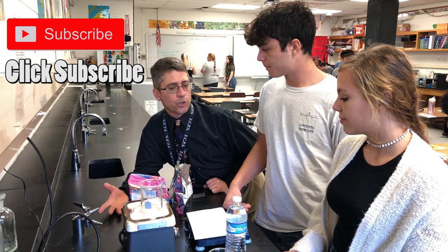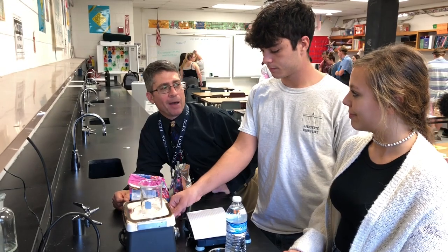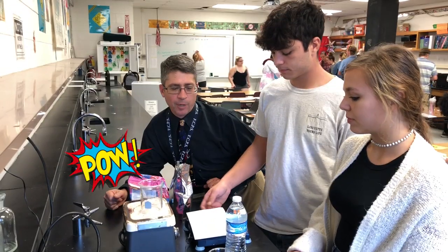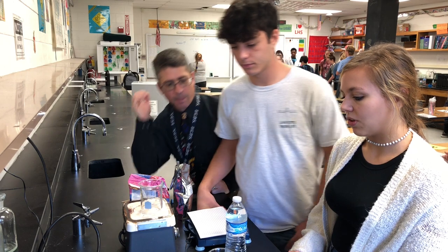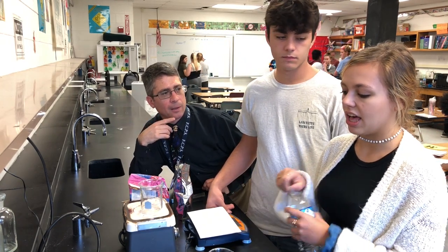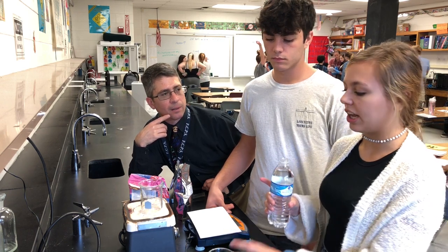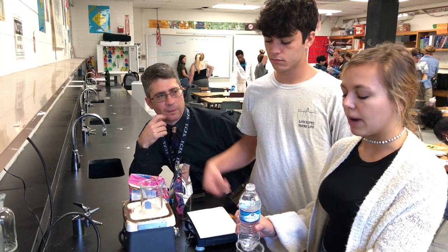So the CO2, what does that do for the root beer? It carbonates the root beer. Ah, so we're making a carbonated beverage. All right, well, let's get this lab going. Show us how it's done. Walk us through the process. The first thing we're going to do is measure 25 milliliters of spring water, and we're going to heat that on a heating plate to 37 degrees Celsius, which is about body temperature.